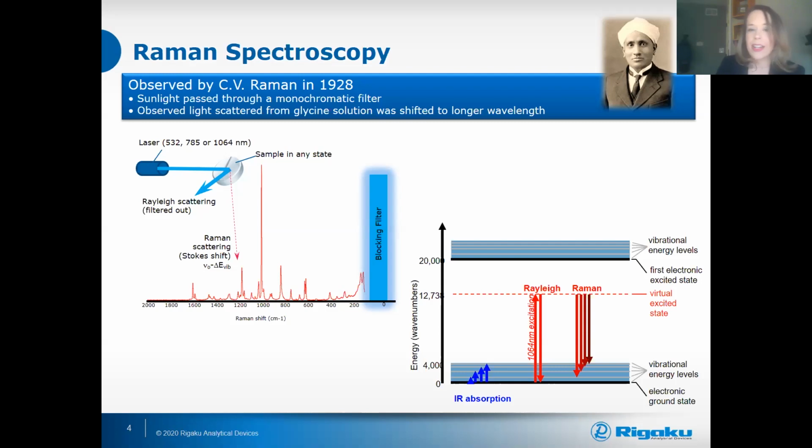And so back in 1928, C.V. Raman discovered this. And over many, many decades, and then what became a century later, we have developed technologies now in the field of Raman technology that allow instruments that used to be the size of, say, a large bench or a large lab test desktop to be miniaturized to the size of a handheld instrument. This was very, very much a success story for different industries about a decade ago, including the safety and security industry, that utilize this miniaturization of Raman spectroscopy for a lot of advantages.